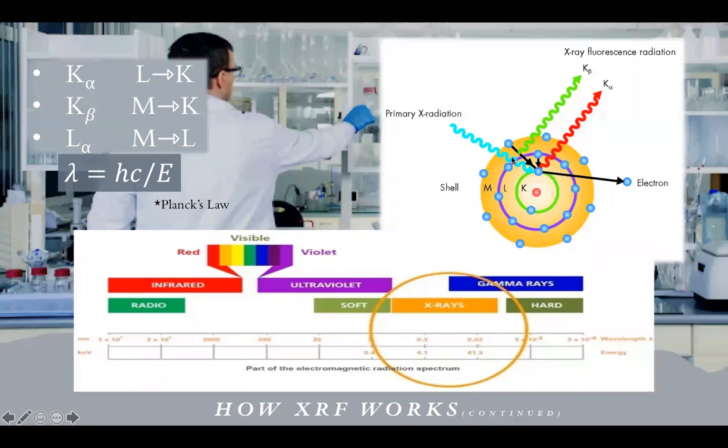How does this happen, and what are some of the inner workings of X-ray fluorescent spectroscopy? If we know anything about electromagnetic radiation, we know that X-rays have the power to disturb the inner workings of atoms. So we use this understanding, and X-rays are used to excite the sample, causing the emission of electrons or fluorescent X-rays from the sample, which have energetic characteristics of the elements which are present.